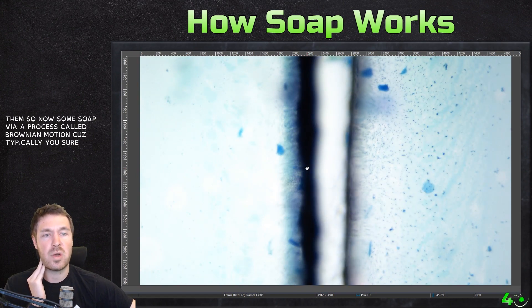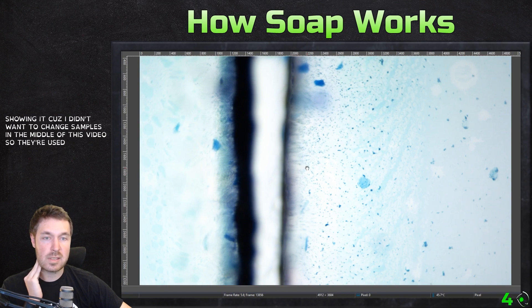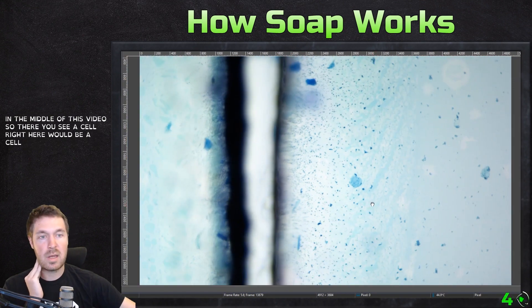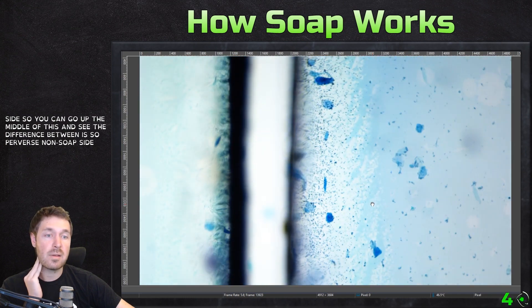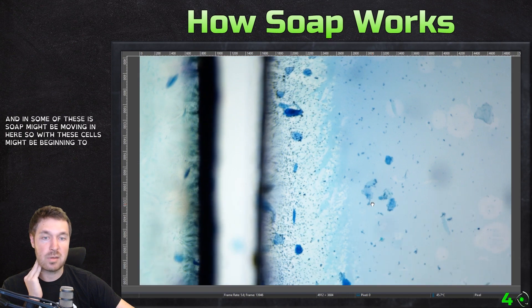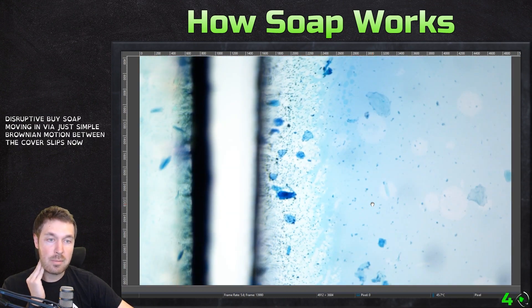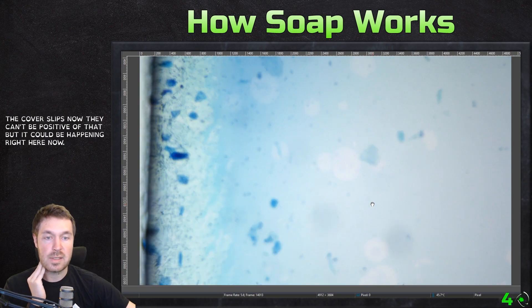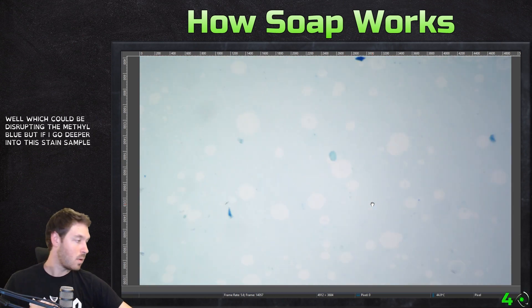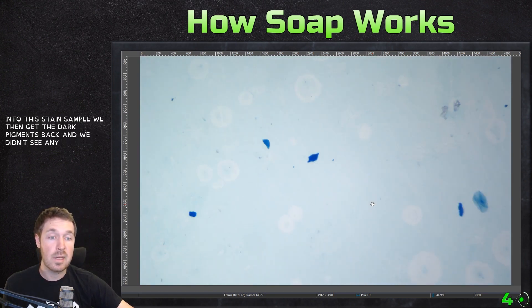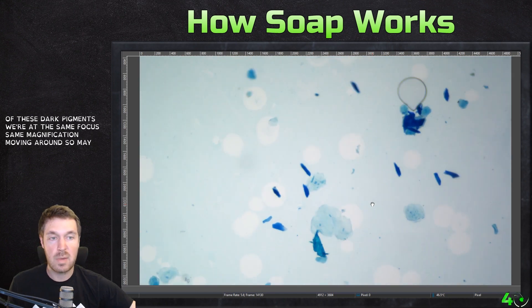And now if we go back right here, we're seeing the interface between the two. So this is the cover slip that separates them. Now some soap, via a process called Brownian motion, is moving between the cover slips — because typically you shouldn't put cover slips this close together on the same slide, but I'm just showing it because I didn't want to change samples in the middle of this video. So there you see a cell — right here would be a cell. Then over here, that's the non-soap side, and over here is the soap side. You can go up the middle of this and see the difference between the soap versus non-soap side. In some of these, the soap might be moving in, so these cells might be beginning to be disrupted by soap moving in via Brownian motion between the cover slips.